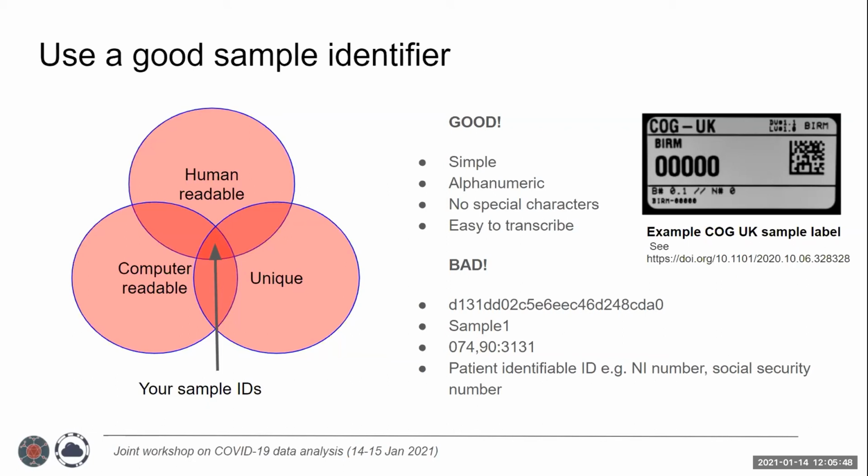It's also a good idea to think about printed sample labels as well, which you can use throughout the lab work. This requires a certain degree of infrastructure. COG UK, for instance, uses these pre-printed barcodes, which again is described further in the Majora preprint. And I'll give the full link for further reading material.